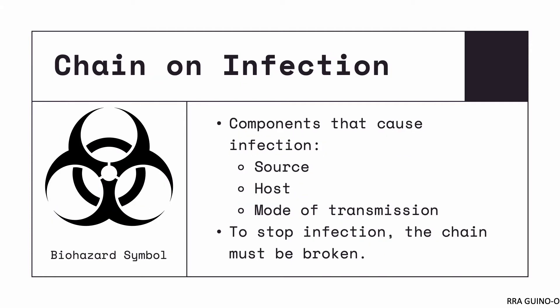Let's now talk about the chain of infection. This is an epidemiological principle that explains how infection is passed from one person or organism to another. Traditionally, it is composed of three components: the source, the host, and the mode of transmission. The biohazard symbol is a diamond with three circles indicating these three components. In order to stop infection, we have to break the chain of infection, as indicated by the gaps on the circles in the biohazard symbol.